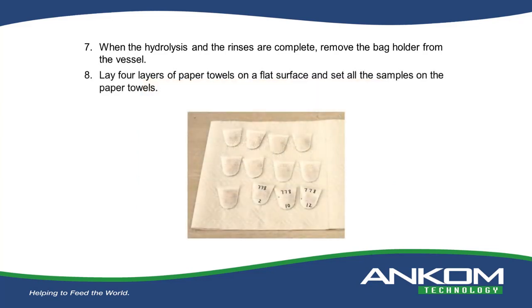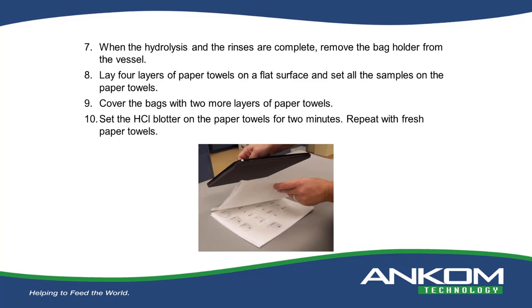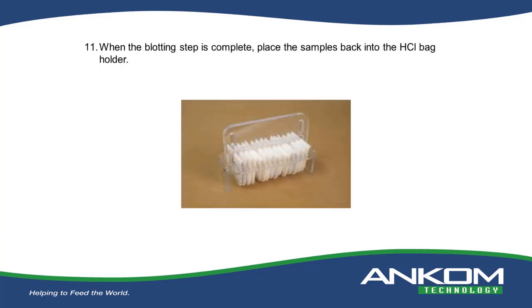Place 4 layers of paper towels on a flat surface and set all the samples on the paper towels. Cover the bags with 2 more layers of paper towels. Next, set the HCl blotter on the paper towels for 2 minutes. Once the 2 minutes is up, repeat with fresh paper towels for another 2 minutes. When the blotting step is complete, place the samples back into the HCl bag holder.